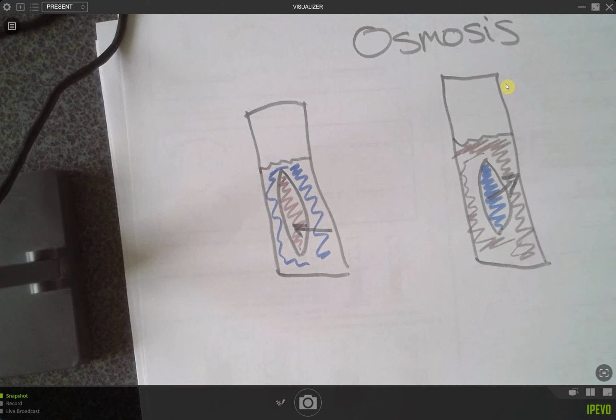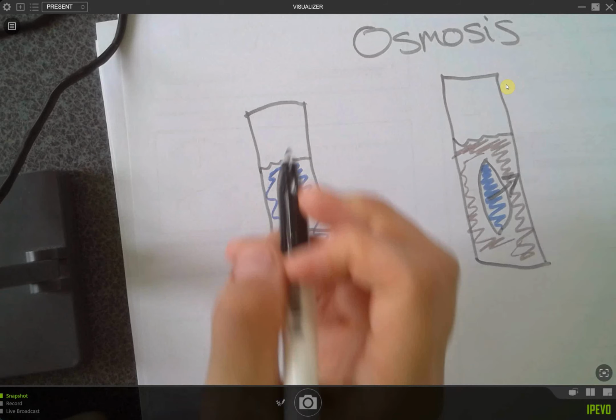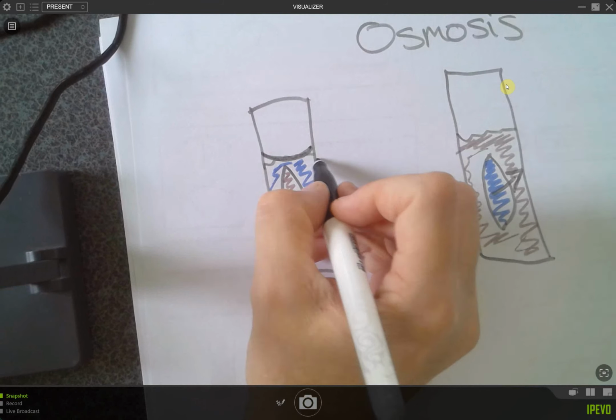You're going to need to be able to take that measuring cylinder and read it properly, so that way you have accurate results. So remember, with that measuring cylinder, you go to eye level, where that level of water is, and you're measuring at the bottom of the meniscus. When we say bottom of the meniscus, we're talking about how the water kind of curves, you see? You measure at the bottom of that section.